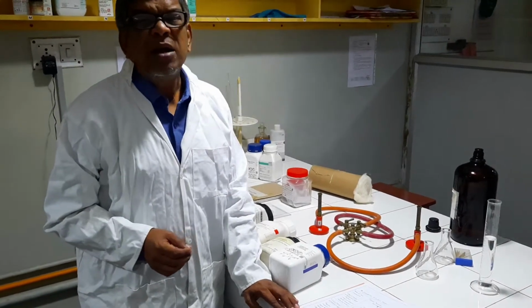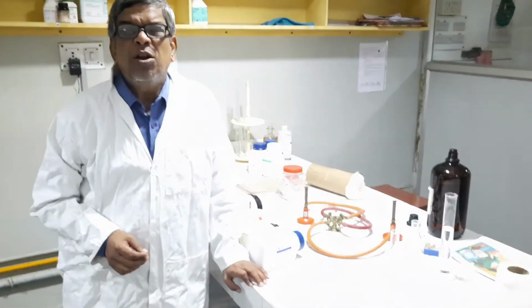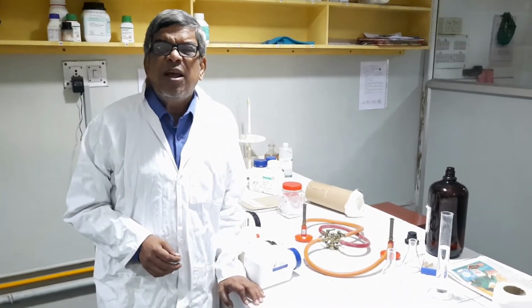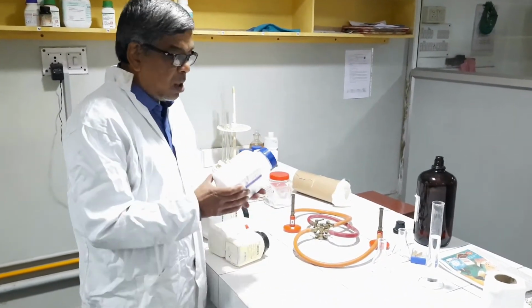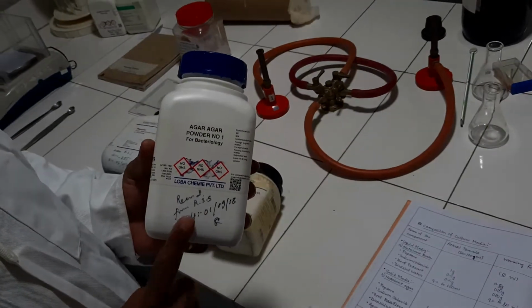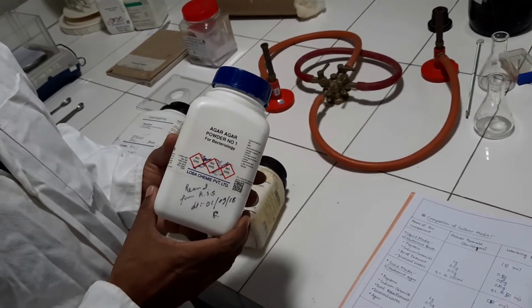Agar or agar-agar is a gelatin-type carbohydrate compound, present in the Great Barrier Reef of northern Australia. From the northern part of Australia, this agar-agar is taken and purified, and it is prepared as agar, which is a solidifying agent. It will be used at 2%. So for 2%, we will prepare 100 ml, 2 gram for 100 ml. This is a simple powder, right? But this is a gelling agent, a solidifying agent.